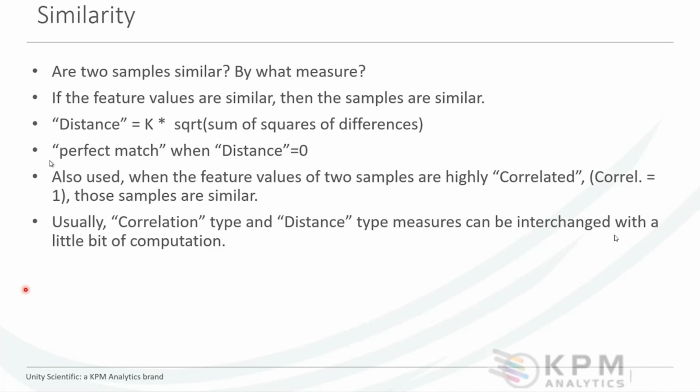So this goes back to how we ended our last lesson when we were talking about quantitative data analytics. I call this a spectra first perspective. Our approach to dealing with a lot of this modeling, quantitative and qualitative, and our population structuring and our outlier determination is based on investigating the spectra first, because we're trusting that where the spectral variability leads, our sample variability will follow. And we're going to be doing that also in qualitative analysis.